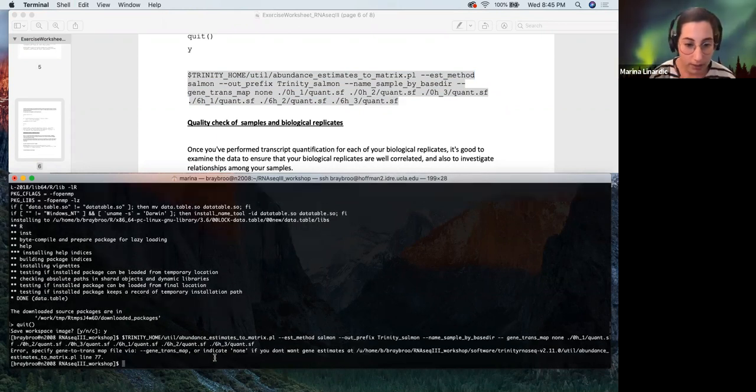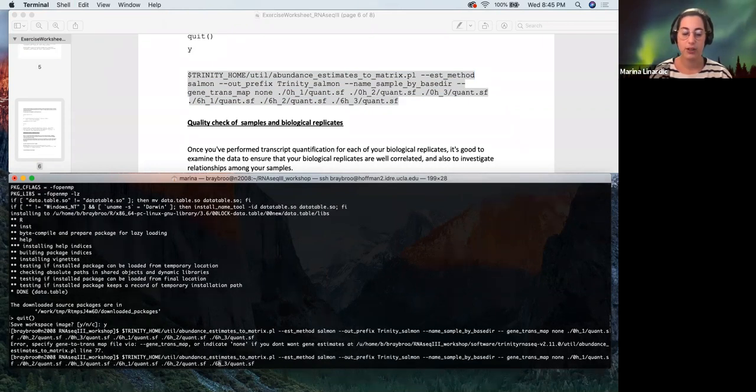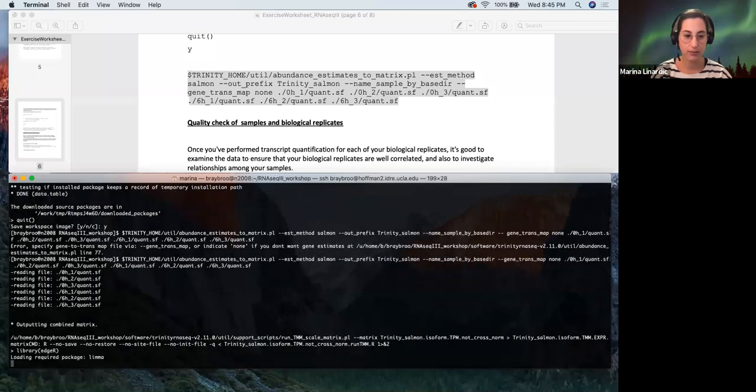And we get an error. There is none. Okay. There's a space here. You can see the command line can be very sensitive. It is sensitive to every mistake that you make. I hope that's the only one. Yes.